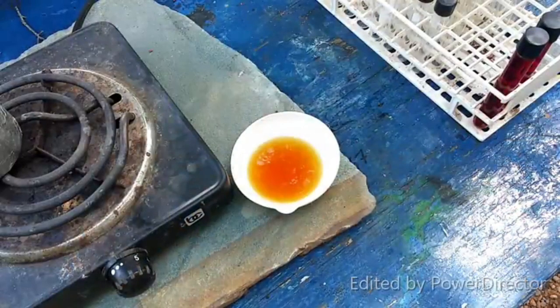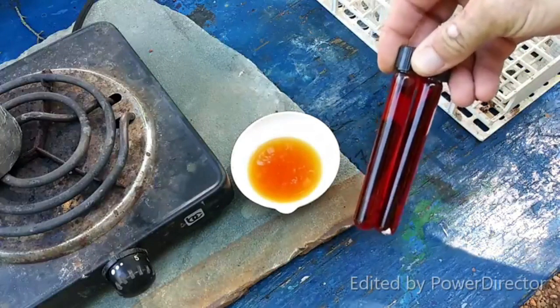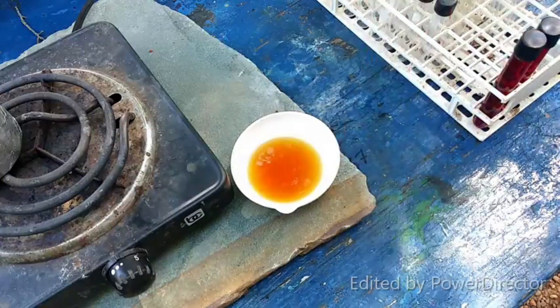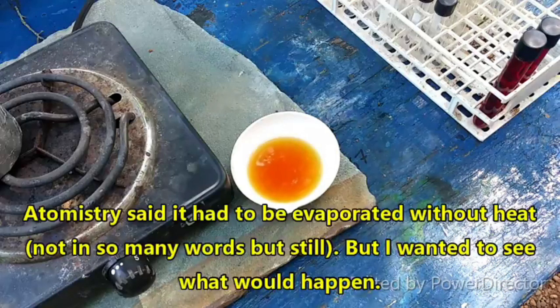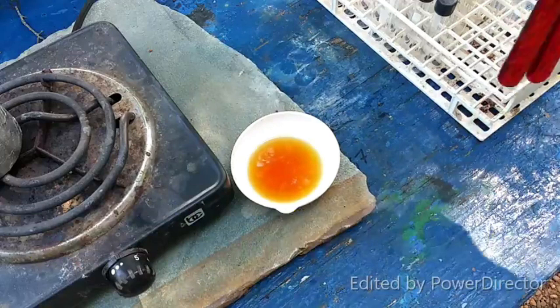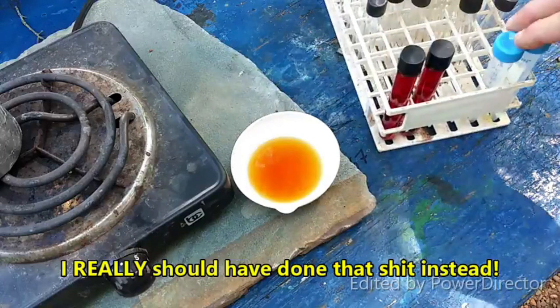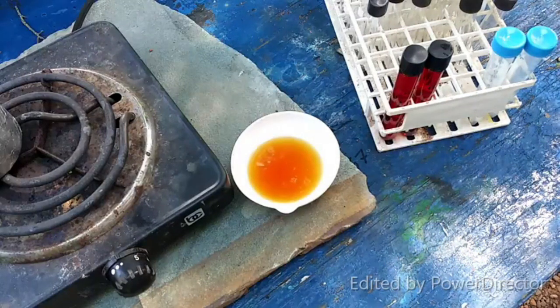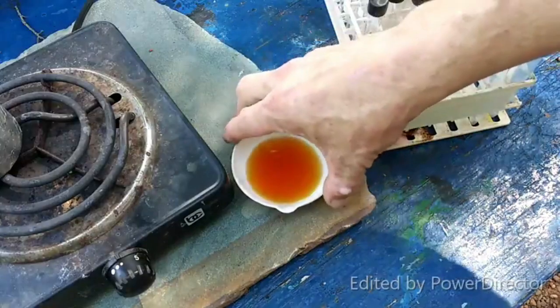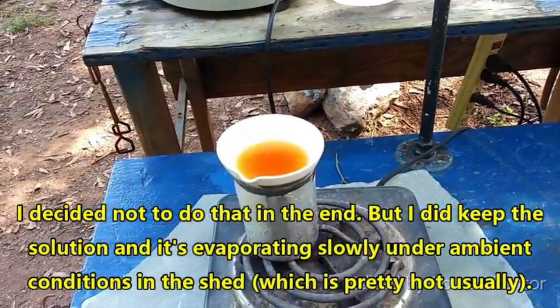Okay, as you can see, heat really does a number on the color. Here is the original solution, here are the other two vials that I saved, and here is what we've got here. So it doesn't look like you can use heat to cause this to crystallize. Now, according to atomistry, this complex can be extracted out in ether because it's soluble in ether, but I'm not sure if they mean that's true for the complexes or just for uranyl thiocyanate. So I think the best thing here is to go ahead and let this finish doing what it's doing so we can at least find out what happens when you let that go all the way.